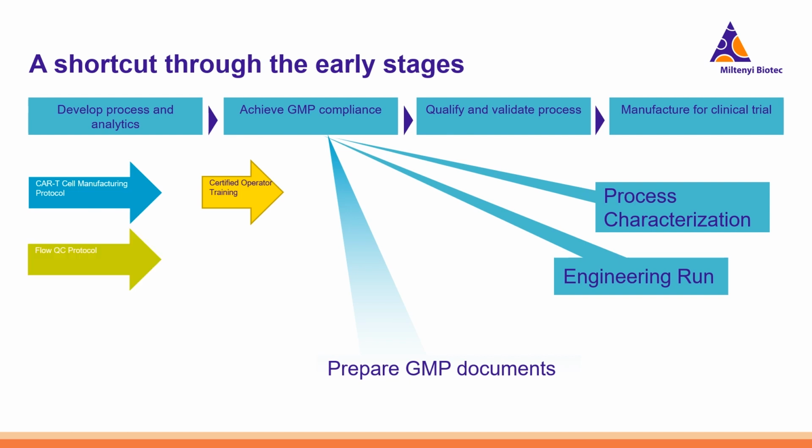In particular, they give you templates and formats which will make it relatively easy to prepare GMP documents. It will also give the staff the know-how in how to perform the actual run. This means that after that, you will be able to start doing the engineering runs and also to start characterizing the process.